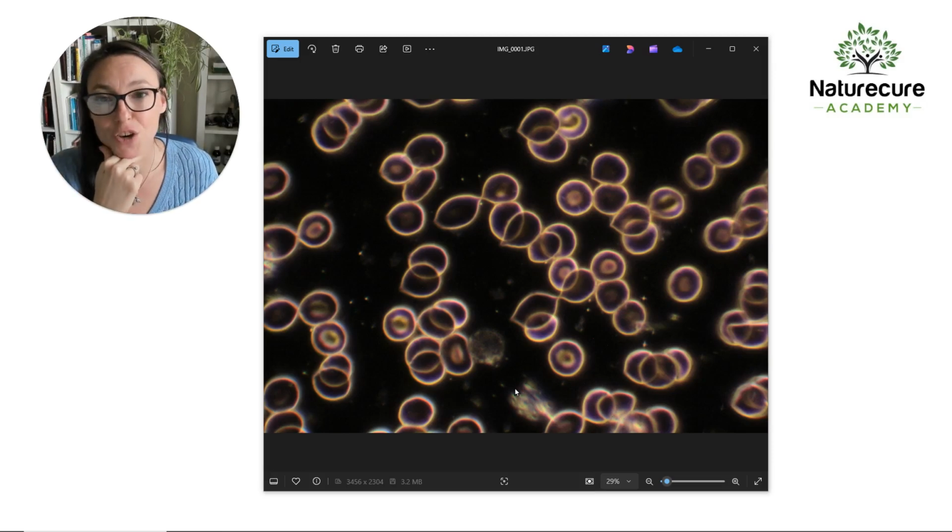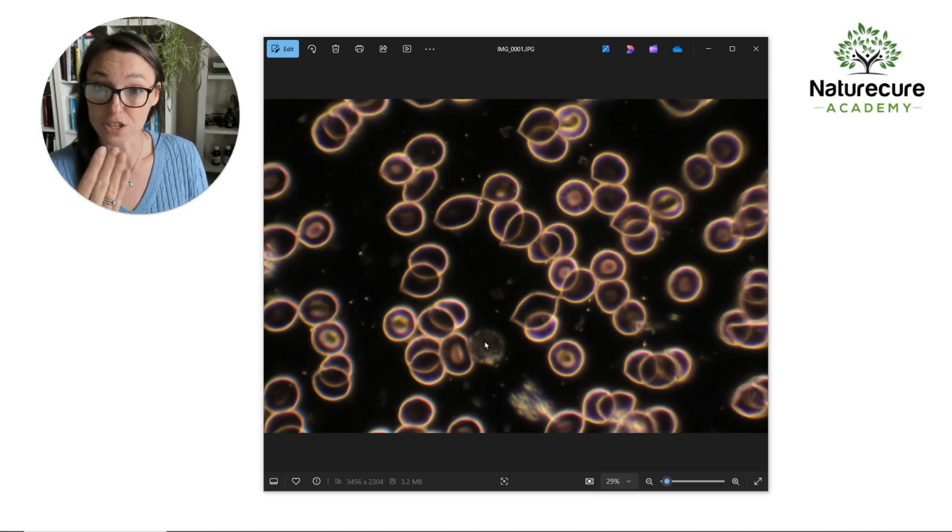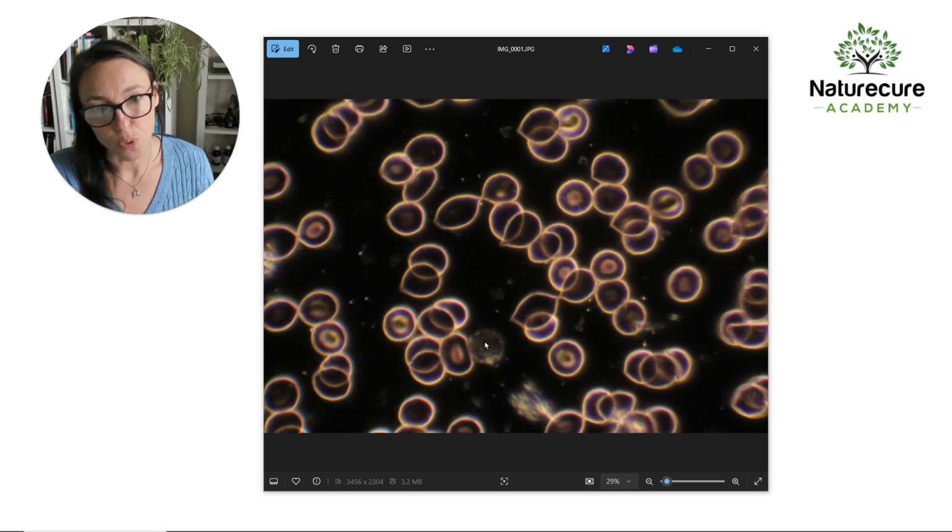I am the director of our live and dry blood analysis training course. And this is just a quick video to show you a little snippet of the process that an analyst goes through when looking at blood. I have already seen this person's blood and taken lots of photos. So this is me in my report phase.